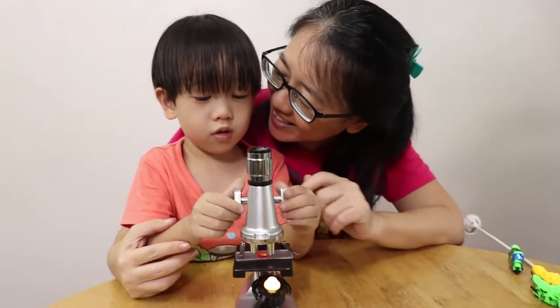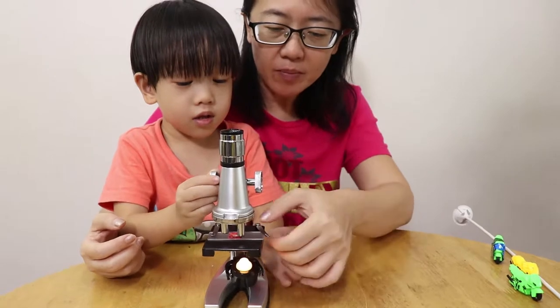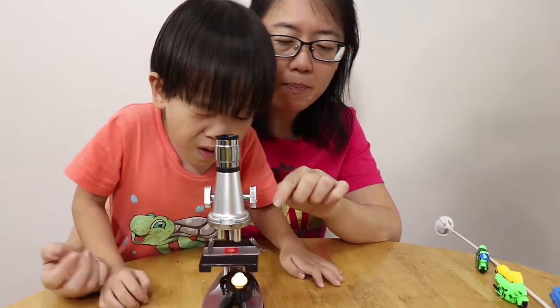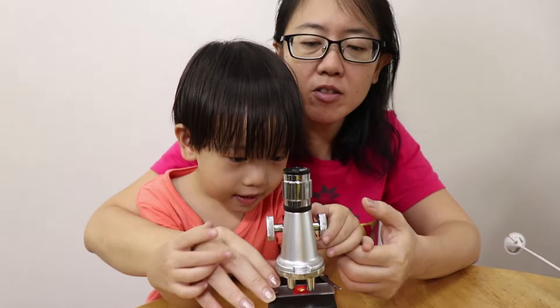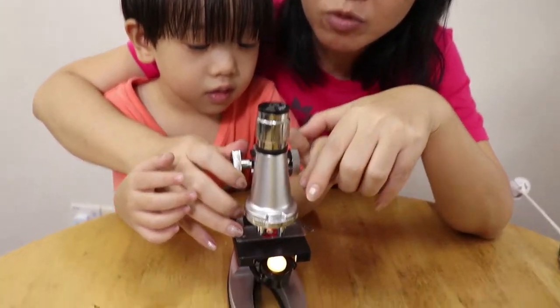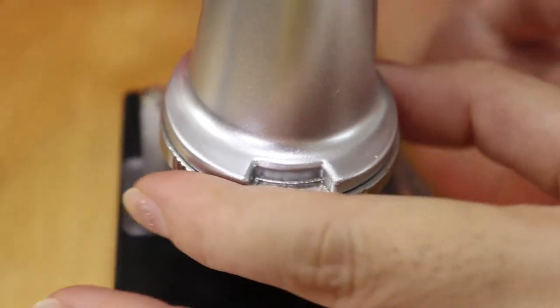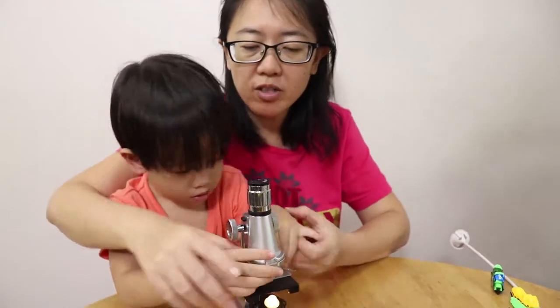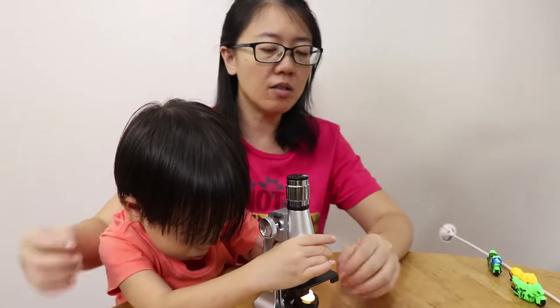You do not expect to see a very sharp image or very clear view of the item under the microscope. But it is going to be a good learning toy for JC, especially when he's older and knows how to use it. Now he's just having fun looking through the microscope at the slides to view the samples. What we found out is that the image was clearest and easiest to see at 50 to 100 times the size. When you go higher — say 600 to 1,200 times — it was difficult to see, it was darker, and it was hard to find where the object was.